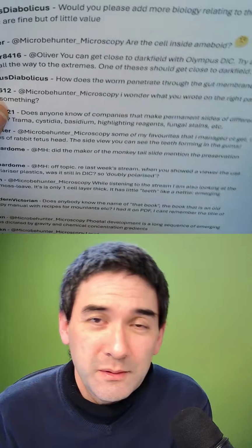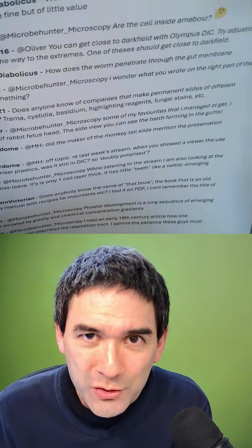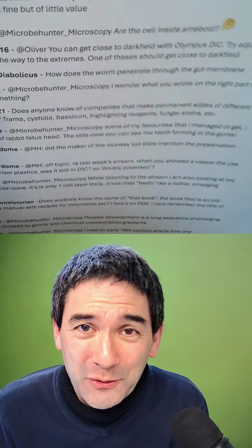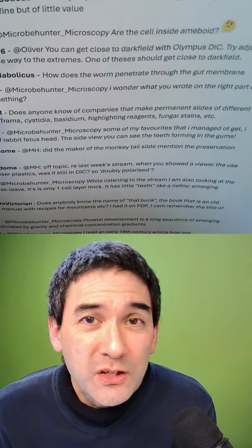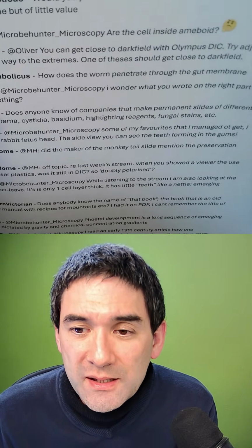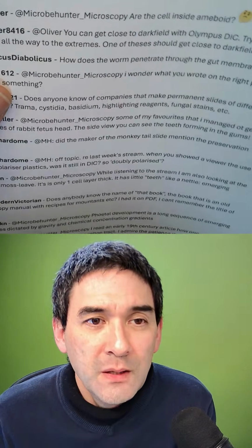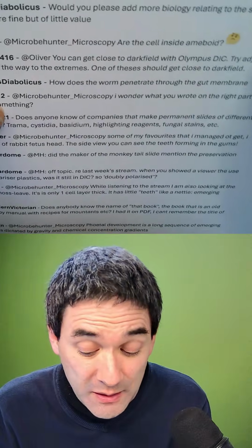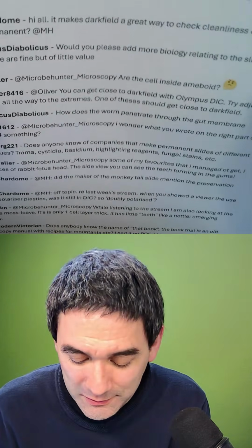Amazon depends, of course, on which brand and so on. Obviously, Amazon is just a retailer, not the company that makes them. But because they're much cheaper, there is quite a lot of dirt sometimes. AliExpress has some surprisingly good ones. So again, my suggestion is as always, don't spend too much, and take it from there.